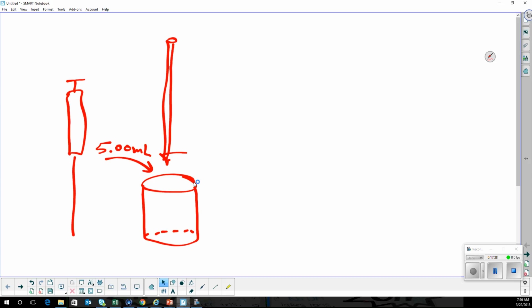When you double click on the graph and you're naming the graph, make sure you click interpolate and the point protector. So you can see the points that you've taken and you can see in between, and it will guess in between where you don't have points. Then make sure you go to 7 on your pH scale and write up and down and print.